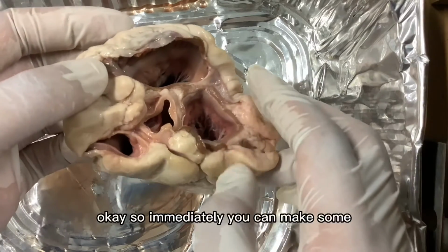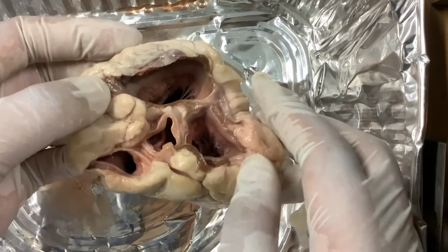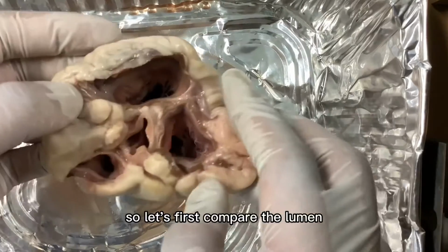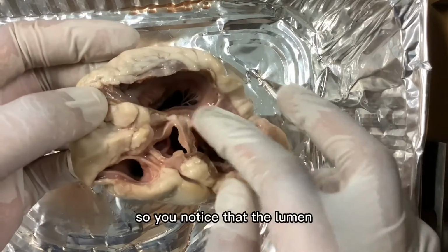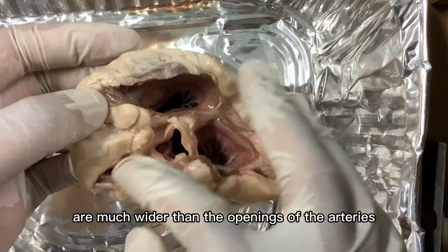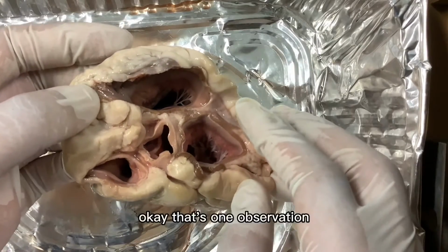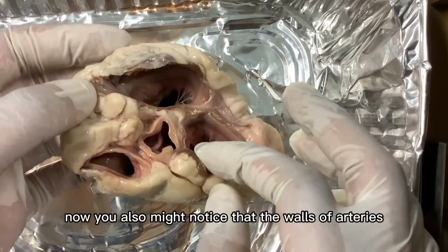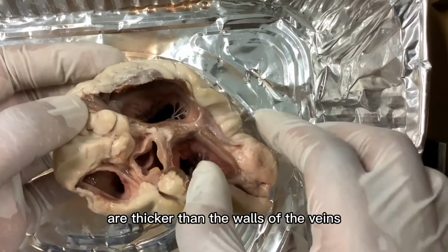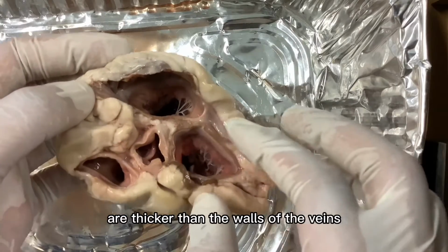Immediately you can make some comparisons between the veins and arteries. Let's first compare the lumen. You notice that the lumen, or the openings of the veins, are much wider than the openings of the arteries. That's one observation. You also might notice that the walls of arteries are thicker than the walls of the veins.